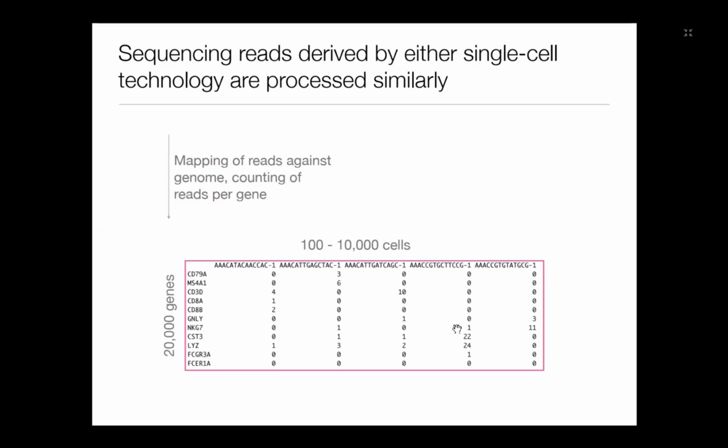So we have a lot of zeros. We are working with single cells, so low starting material. Then we don't sequence really, really deep to have everything. So actually we have a lot of zeros in our data set, and the tools we're using need to be able to handle that. So we are often using different tools as compared to bulk RNA sequencing data.